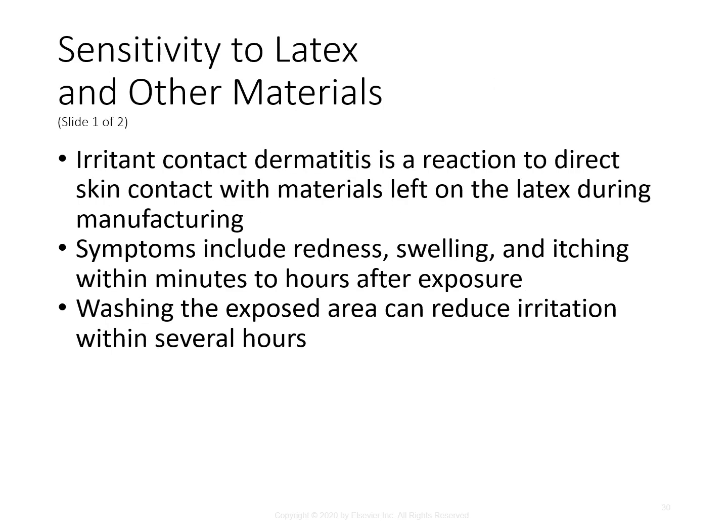All right, so sensitivity to latex and other materials. Most healthcare facilities today actually have stopped using latex gloves and have started to use stretch nitrile or vinyl gloves for this reason, because some people do have sensitivity to latex.